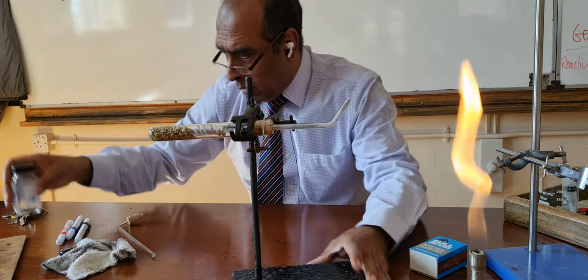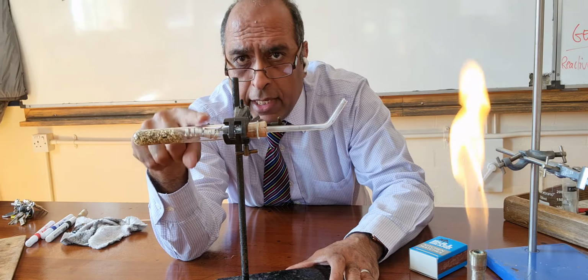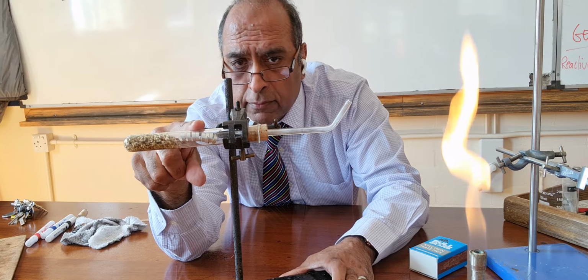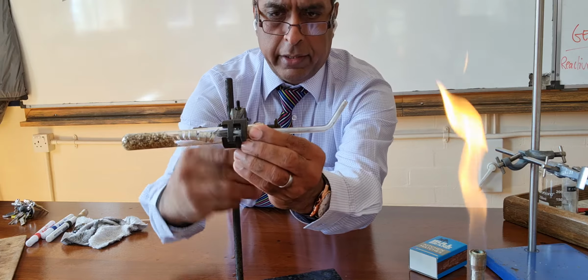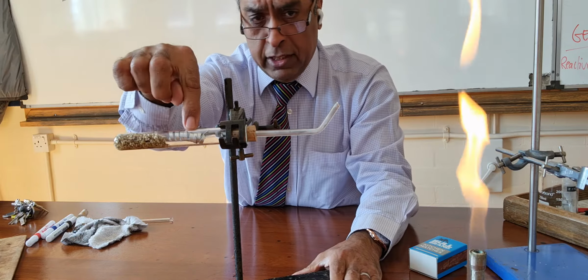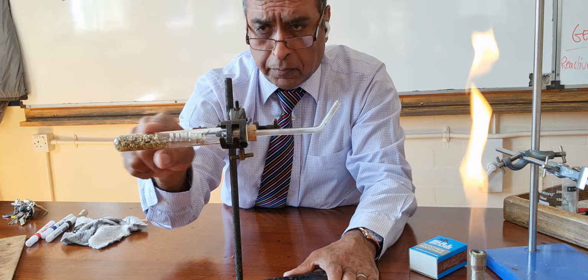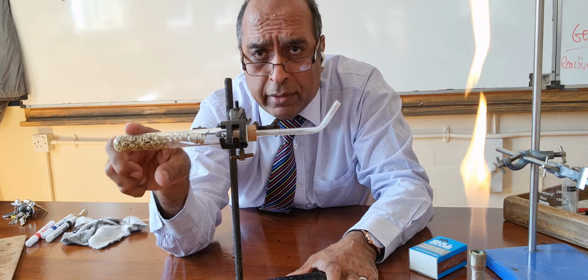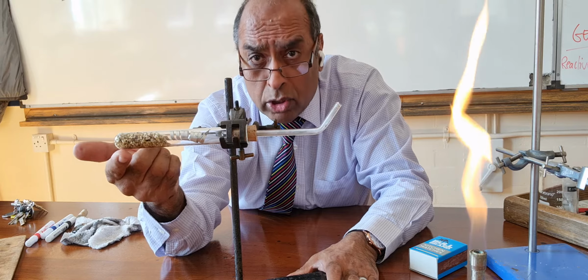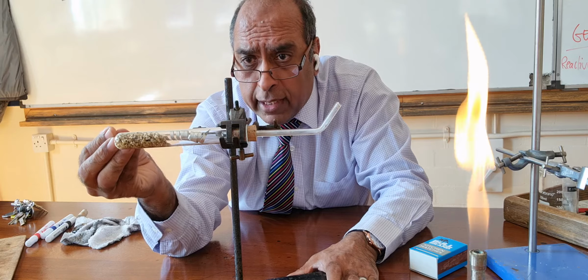Now, I want you to understand here, where my finger is, that is magnesium metal. I'm going to try and grab it a bit further along here. So, magnesium metal. This is ceramic wool at the end. And what we do is we dampen the ceramic wool to keep some water. So there's some water there held by the wool, that's why we're using it.